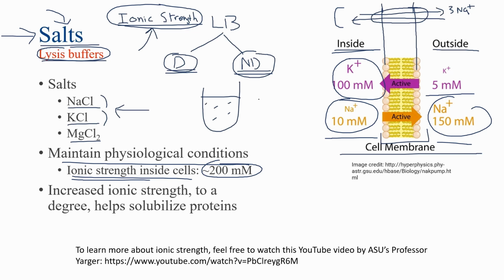Now, importantly, the ionic strength of lysis buffers will vary. So some lysis buffers will have ionic strengths of 50 millimolar, others will have up to 150 millimolar, others will have more, up to, say, 300 millimolar. So the ionic strength will vary based on the cell type that you are dealing with, and also based on what you're attempting to do or what you're attempting to extract. But the idea here is to keep in mind that we are trying to mimic physiological conditions.